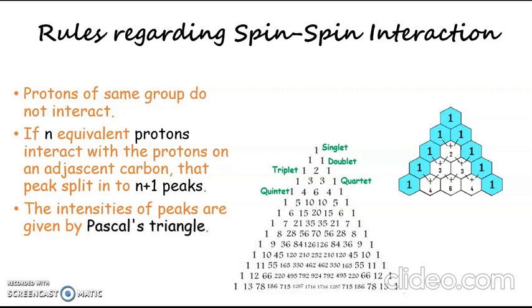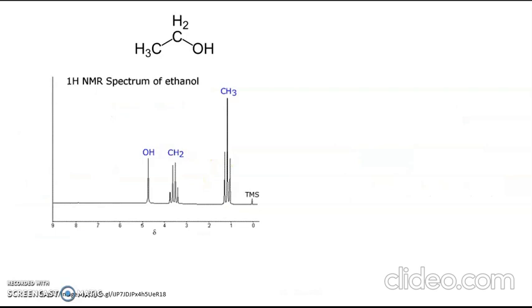Now, we can consider an NMR spectrum of ethanol. The first observed spectrum was in 1951. It is of great importance because it demonstrated the application of NMR to structural elucidation in organic chemistry. It was first observed in Bloch's laboratory in 1951. How do we interpret this spectrum?